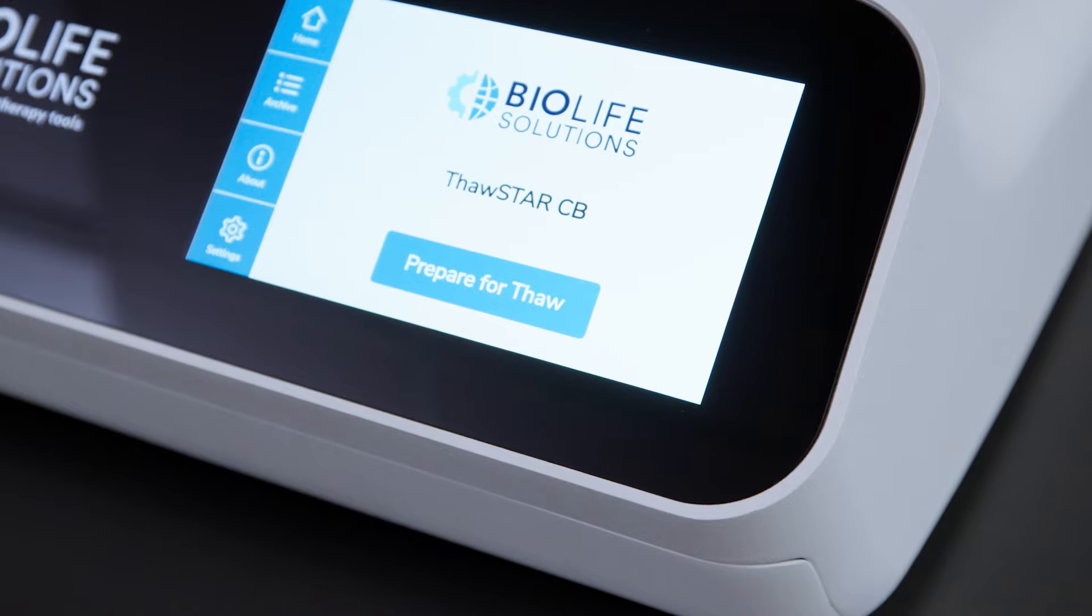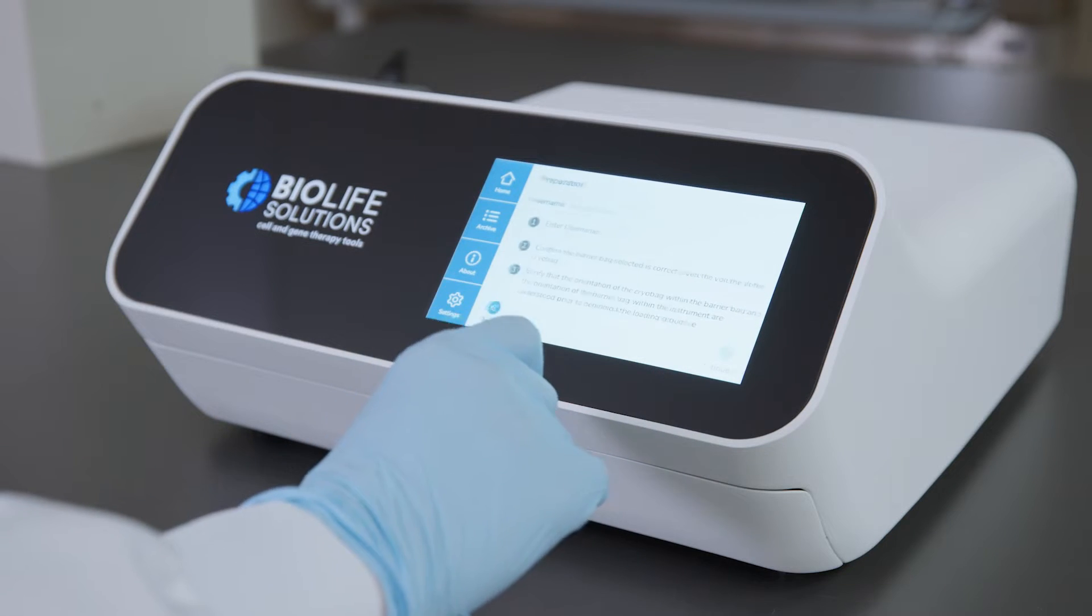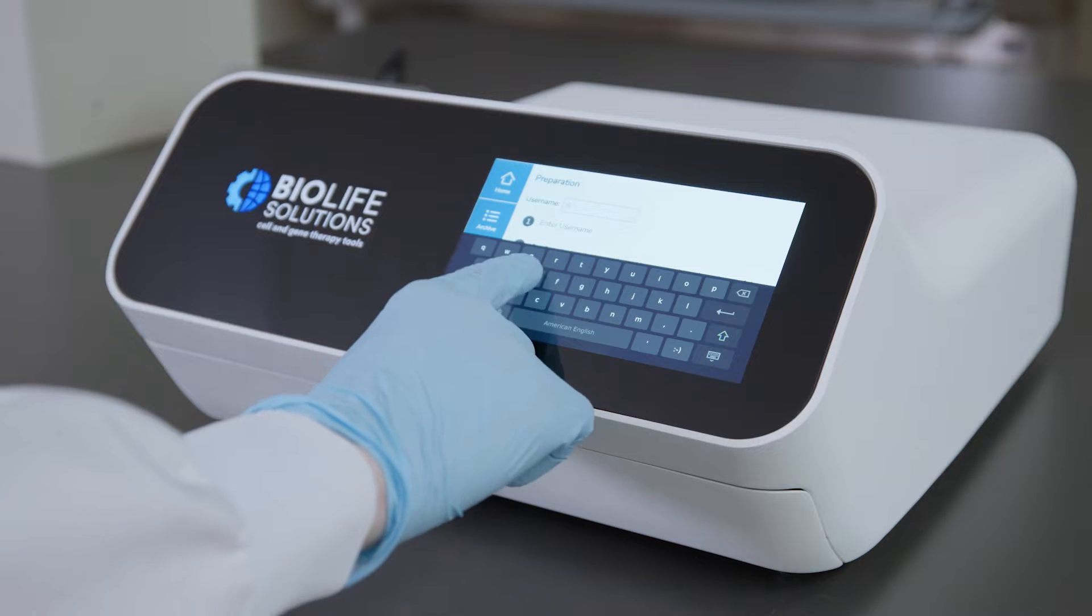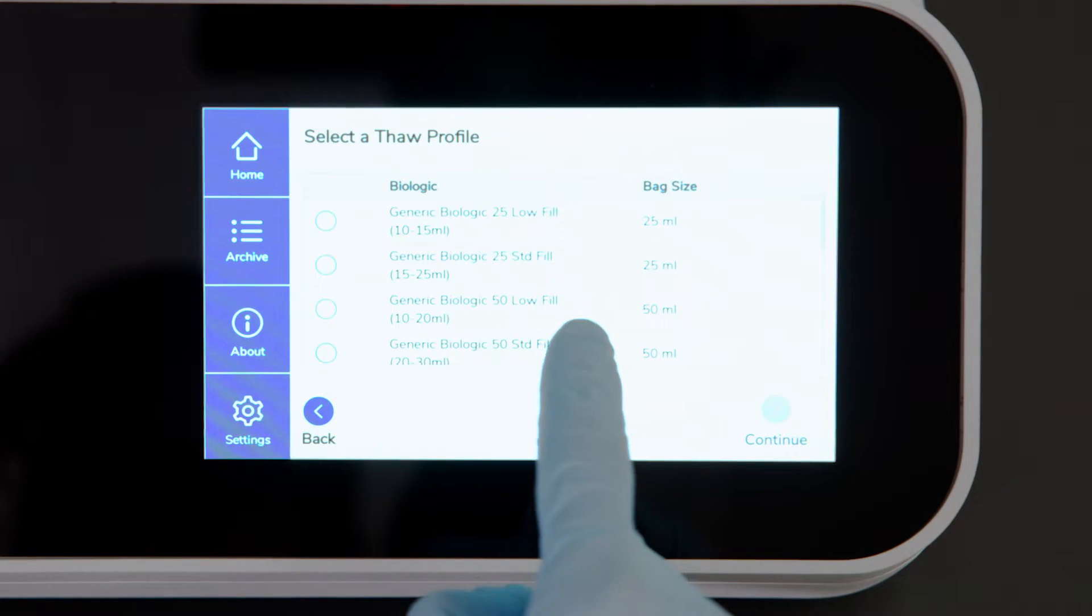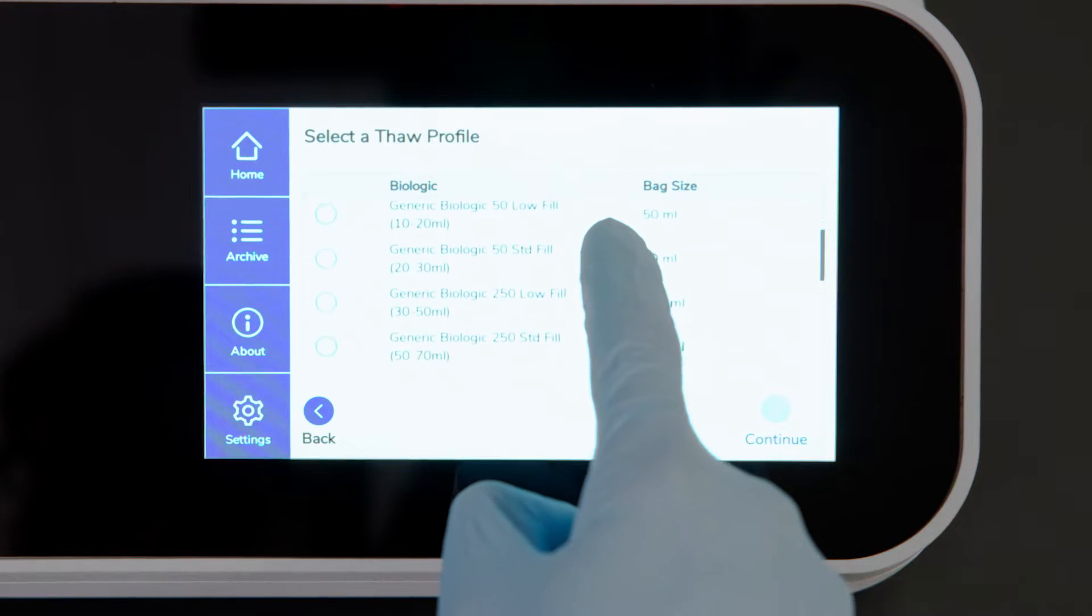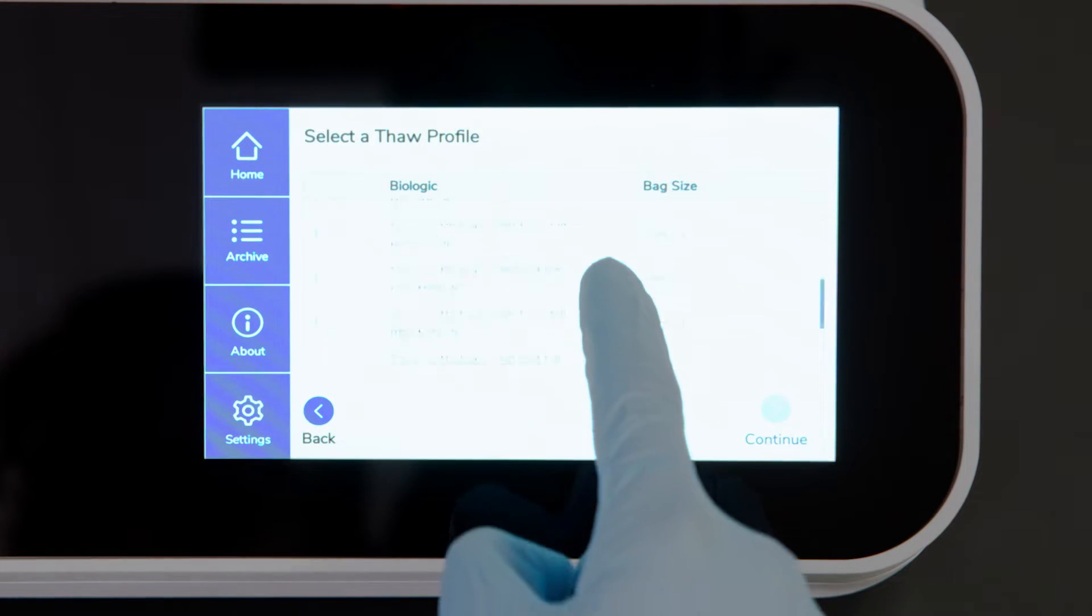When preheating is complete, follow the login sequence and select the size and fill volume of your Leukopax. The Thawstar CB supports thawing for cryobags between 25 and 1000 milliliters. You can choose from several standard thawing algorithms based on popular cryobag sizes.